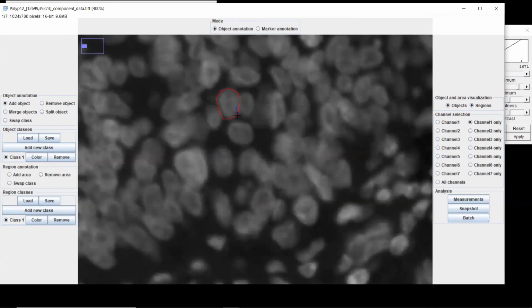With a drawing tablet, it's much faster than with a mouse. As you can see, it's just a region of interest as defined in Fiji. So if you don't go up to the end, it's just going to directly link the first point and the last point.